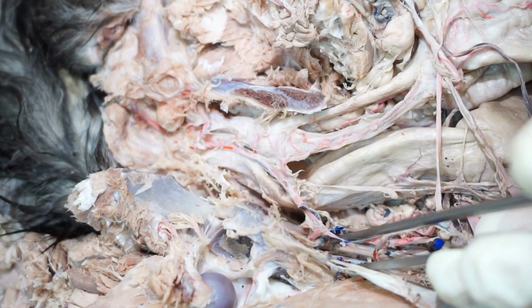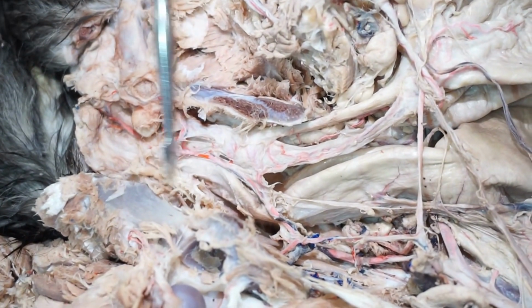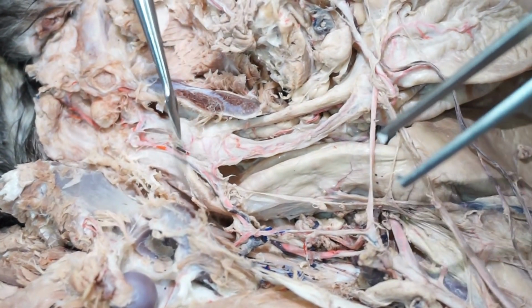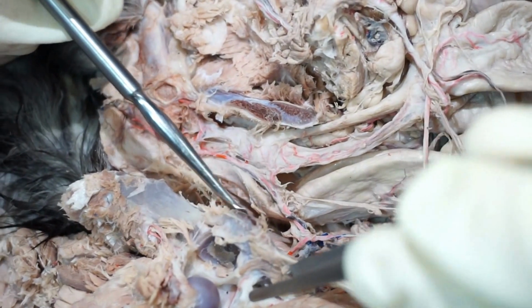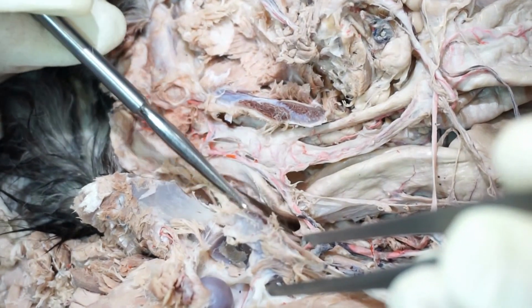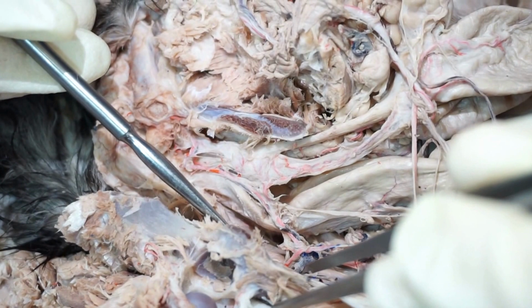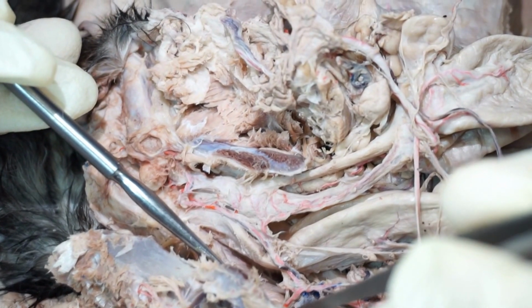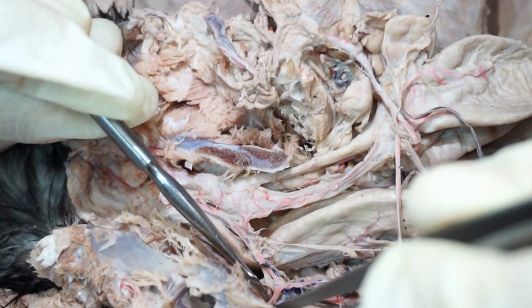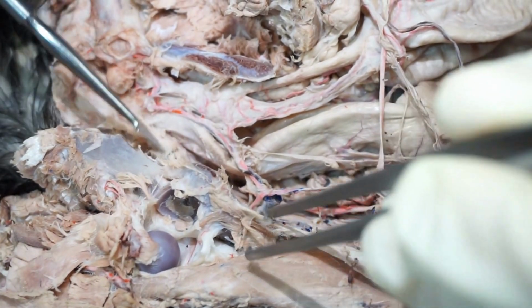In a cat, these will be the major vessels that I would be expecting you to be able to identify. In a dog, we can go a little bit further with the branches, particularly as they terminate, but in a cat, these would be the major ones. Unlike the dog, where the internal pudendal came behind the coccygeus, the caudal gluteal will do that in a cat. So please do not confuse the caudal gluteal for the internal pudendal in a cat.